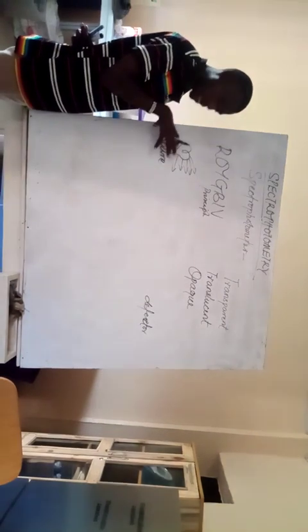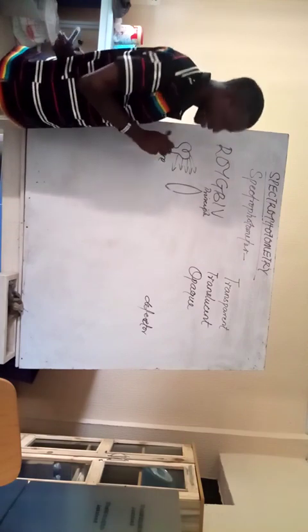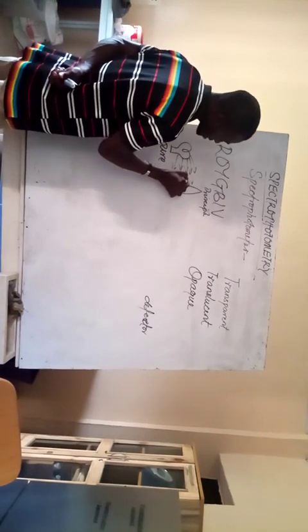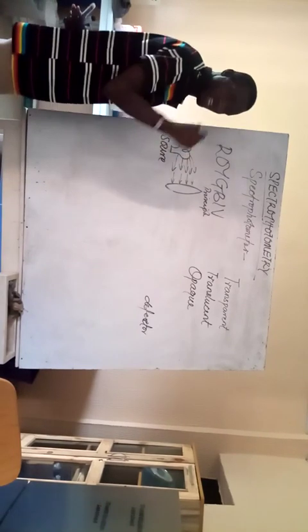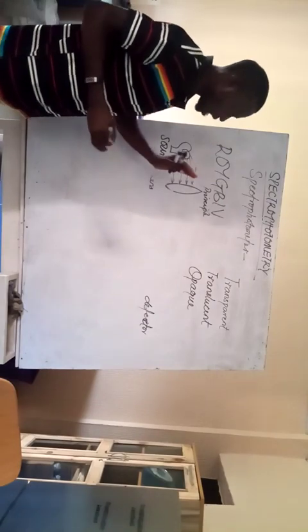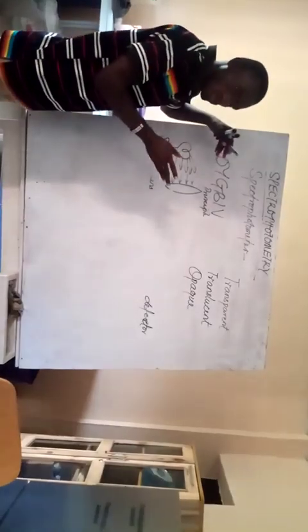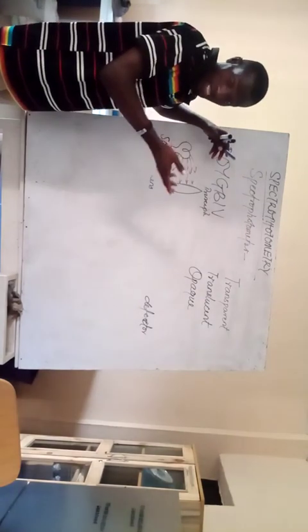Now, light is going to come off of this white light source and hit what is called, in our physics, a lens. The purpose of this lens is to basically focus the light on another material in front. It brings this straight beam of light, because light travels in a straight line, which is the rectilinear propagation of light, a property of light that you already know.